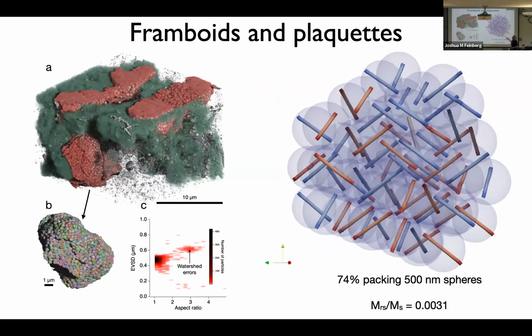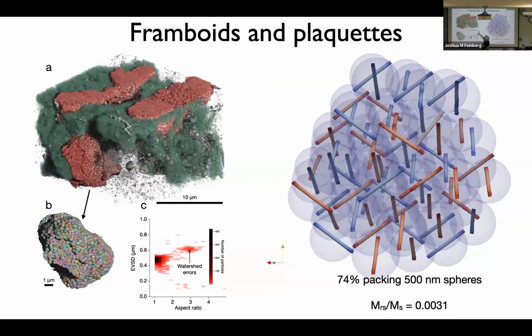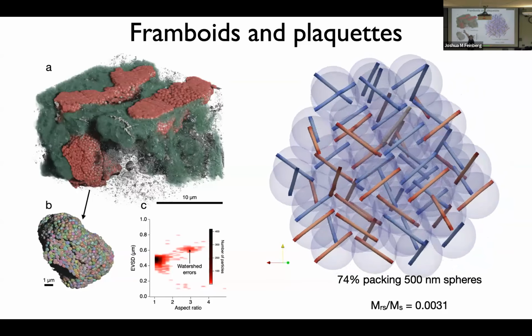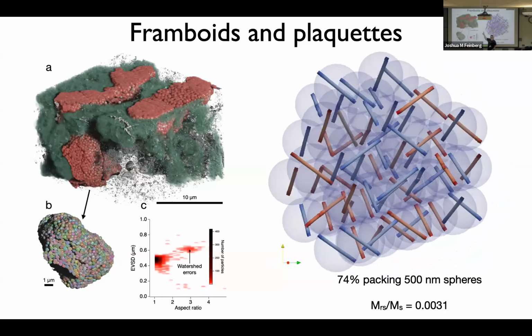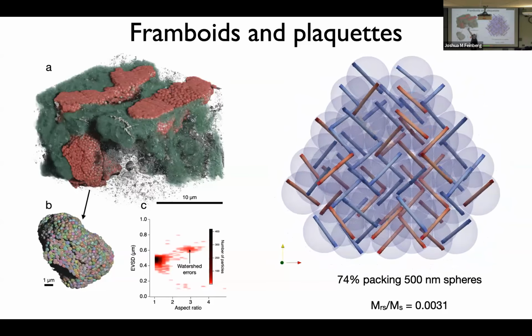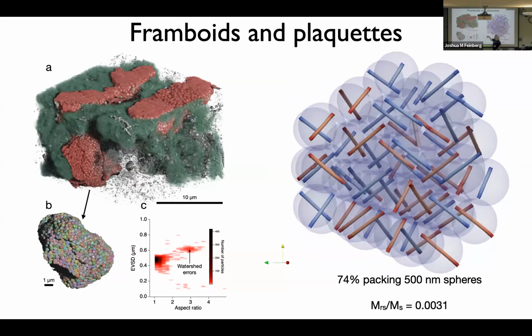So we can reconstruct the three-dimensional information inside that volume. So we have these framboids, magnetite framboids. The green here is carbonate, iron, magnesium, calcium carbonate, which contains magnetite within it. These regions are matrix containing that fine-scale iron sulfide that we discovered with the EDS.